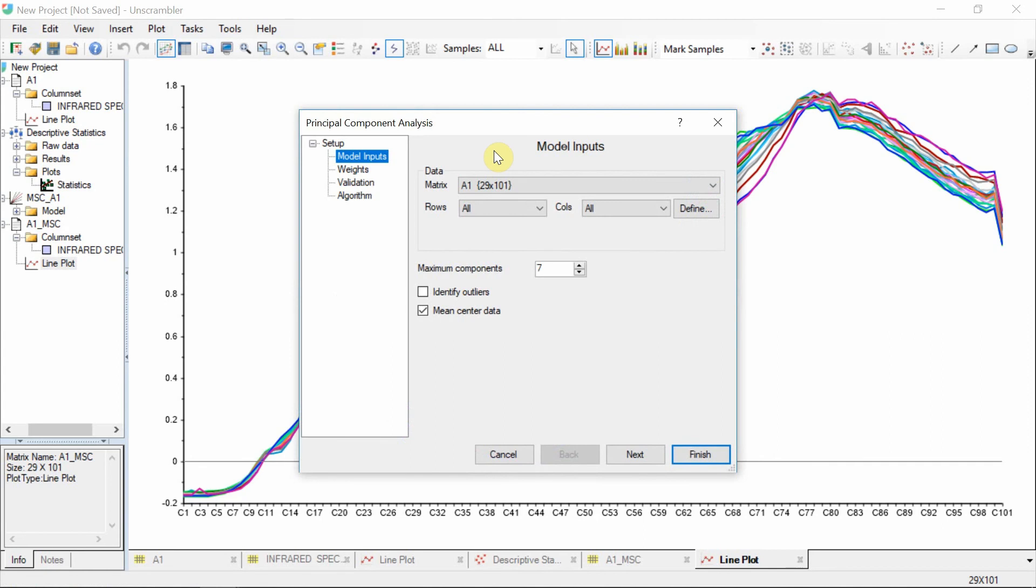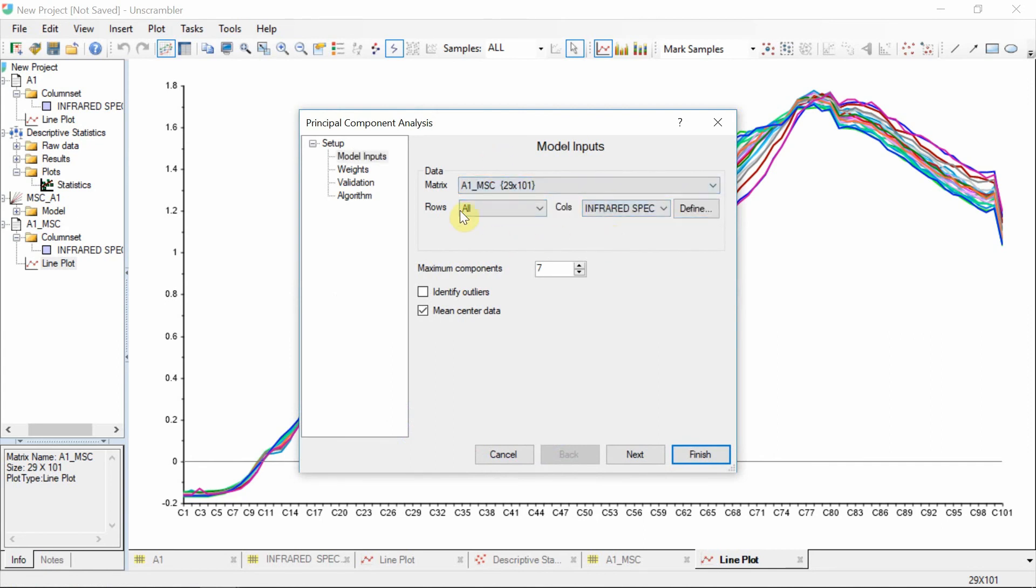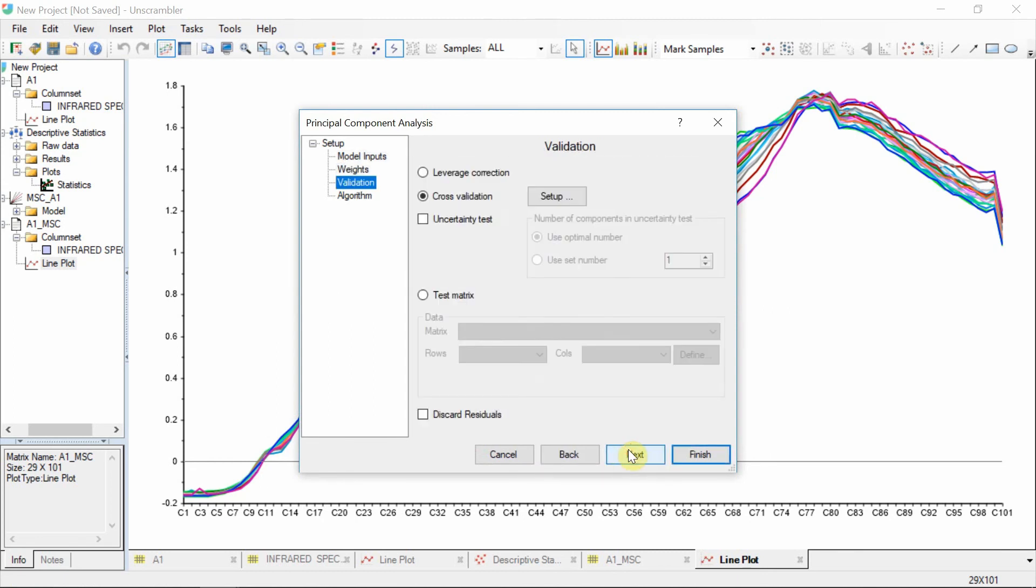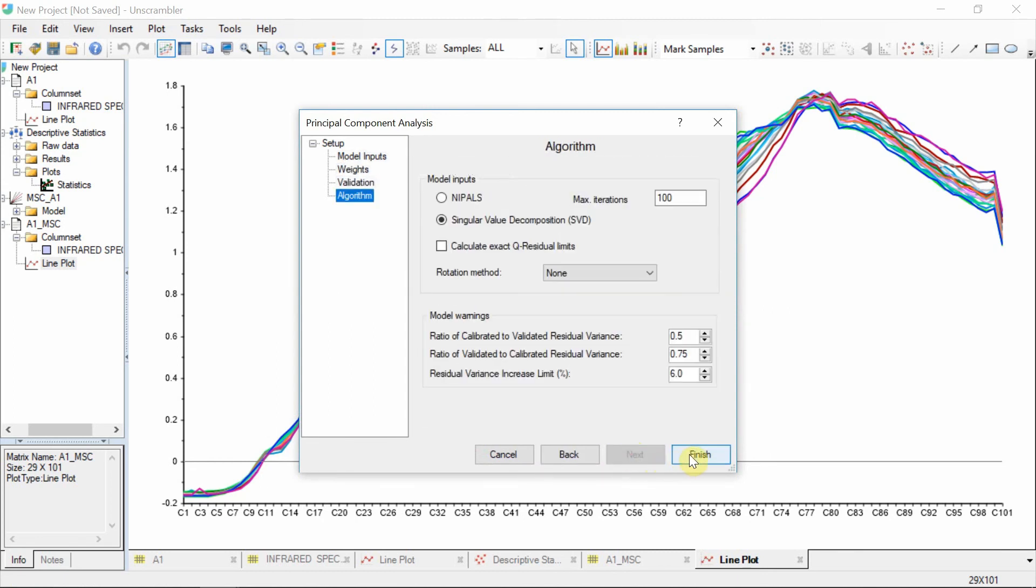Set the transformed spectra as the model inputs here. Once all the other settings have been defined, click Finish to start the analysis.